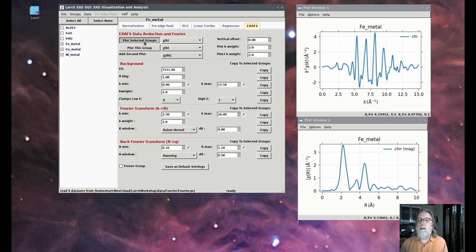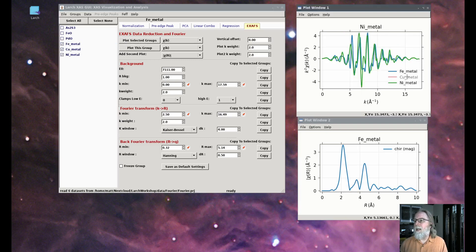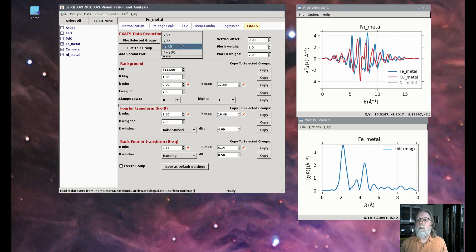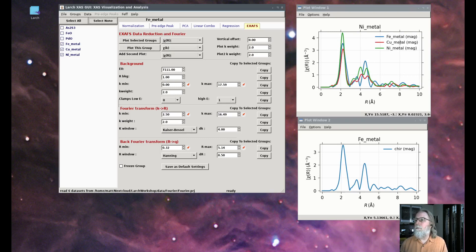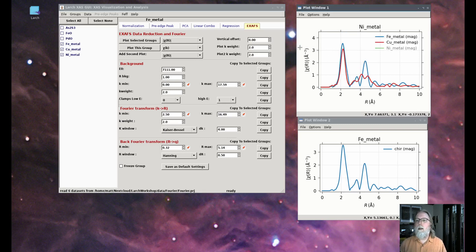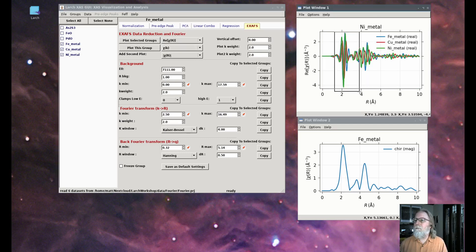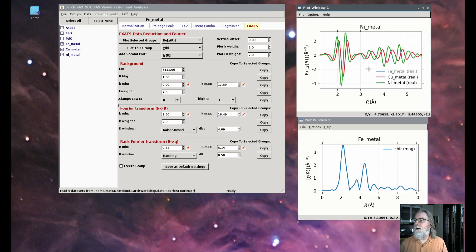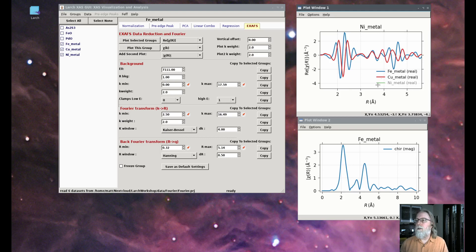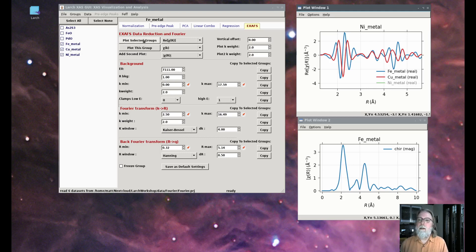If I plot the three metals together in k space, they look quite different. And if I plot the three of them in R space, clearly copper and nickel look much more similar than iron. If I plot the real parts of the Fourier transform, you can see again that copper and nickel look pretty similar — there's a difference in bond distance, but the nature of the oscillations is pretty similar — whereas iron and copper look quite different, completely out of phase. So the Fourier transforms can be informative even without doing a full fitting analysis, for identifying crystal structure or phase in some cases.